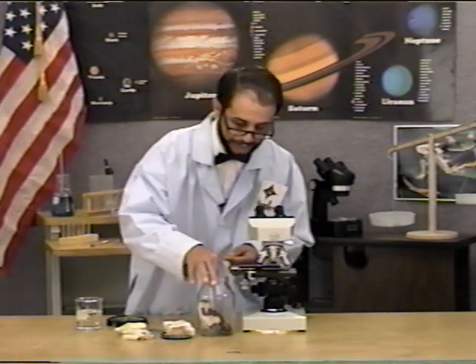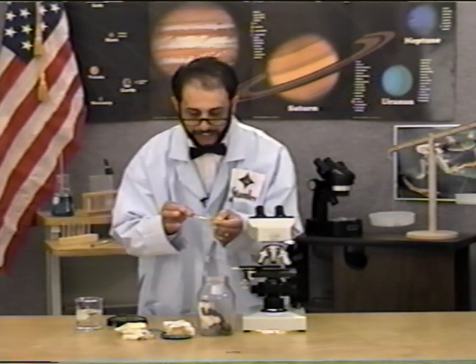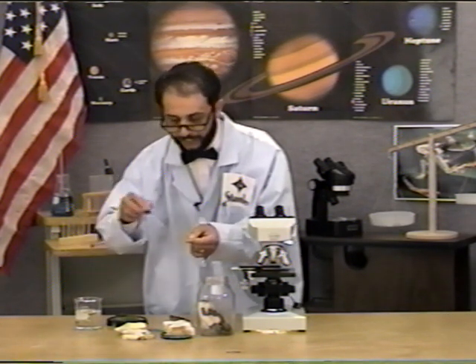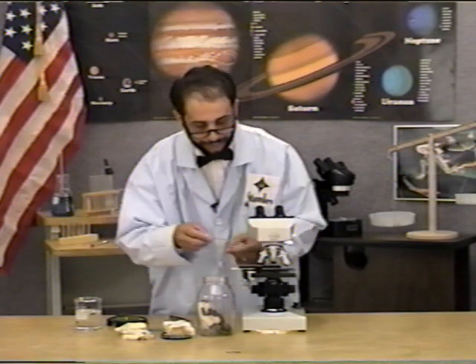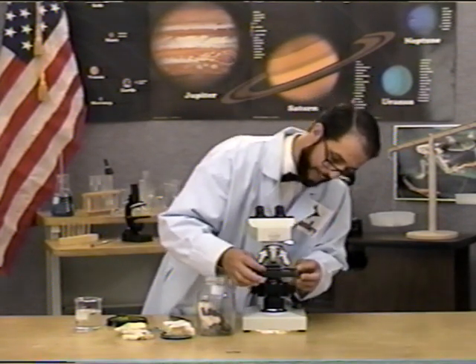We have a microscope here. I'll try to take some of this very carefully, transfer it onto a glass slide, and add a drop of water to it, and then, of course, cover it with a little slip cover. And then we'll put that under our microscope and observe this 3-week-old mold.